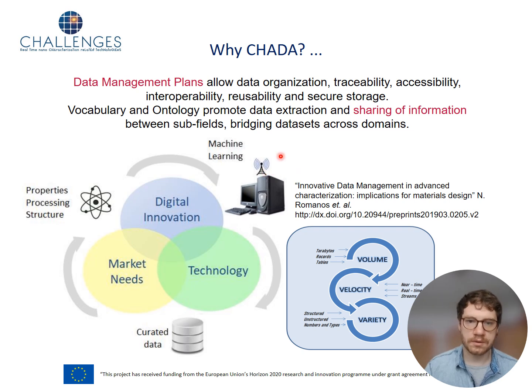So this ecosystem should then enable or accelerate digital innovation and technology development by also taking into account the market needs and enable machine learning on high quality data, also curate and improve the data quality and take into account the underlying fundamental material properties. So the data can then be stored according to different properties that the data has, in which time domain the data was recorded, how big the data is, and how the data is structured in terms of metadata that is available in this regard.